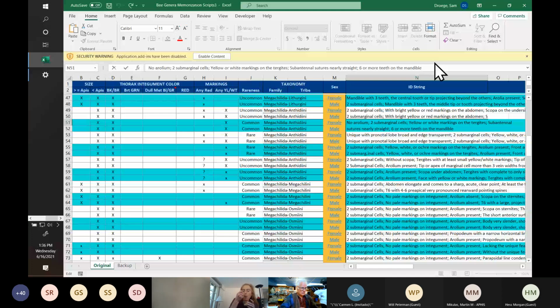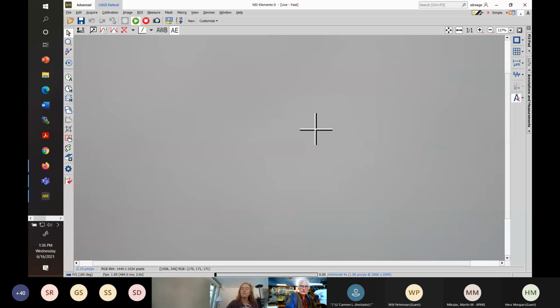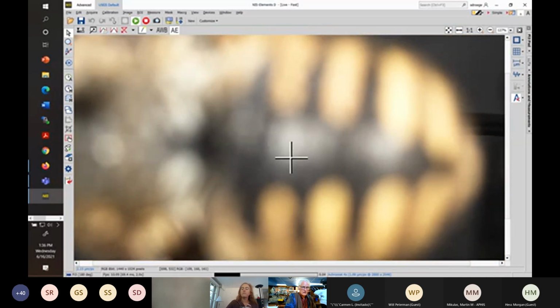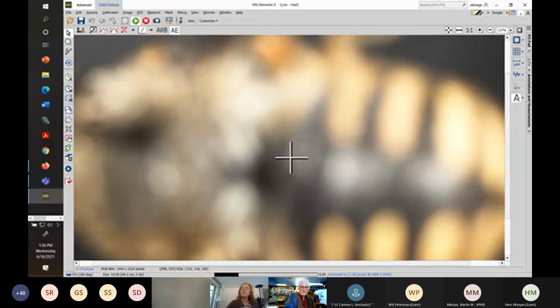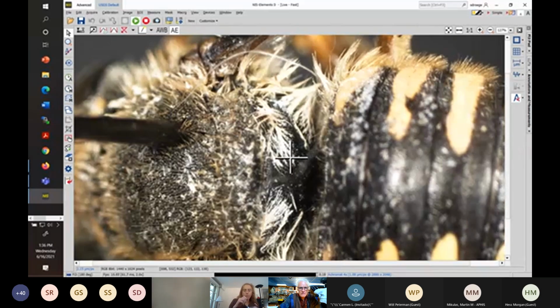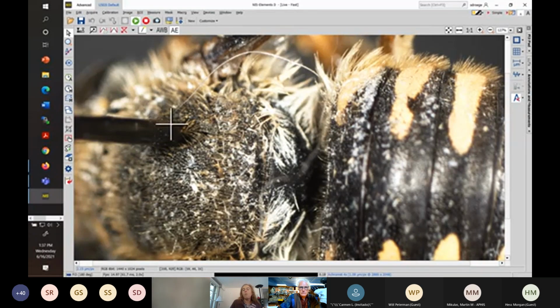So let's see if we can see those features. And we'll also look at the contrasting issue of, does it have that lamellate shelf on the backside? In general, Anthidiums, but not always, are bigger bodied than Anthidiellums. All right, so, dirty specimen, not unusual. Scutum, the pin is going through the scutum. There's one of the wing bases, the tegula over it.